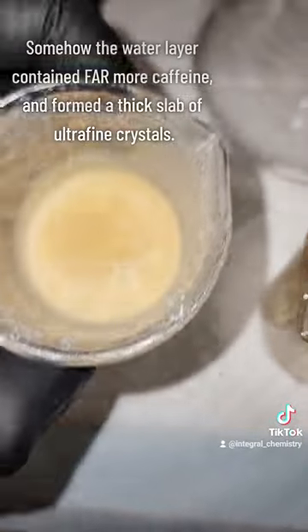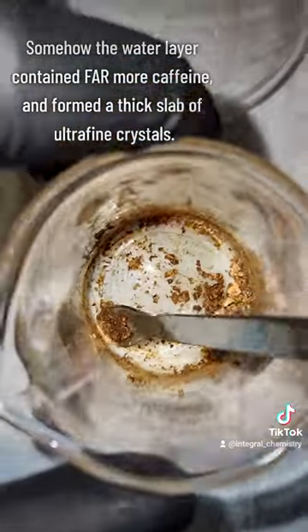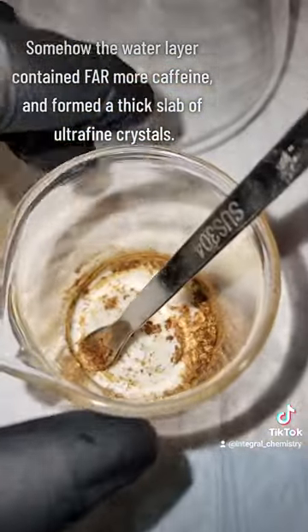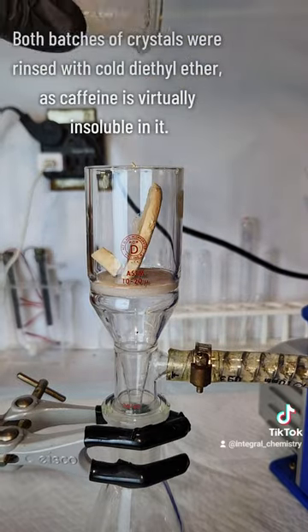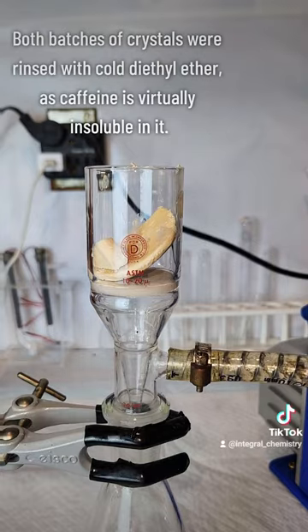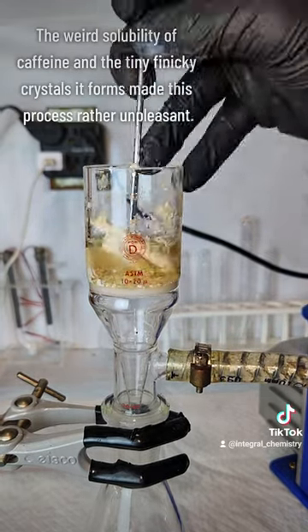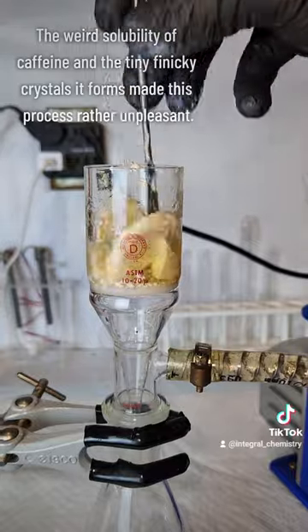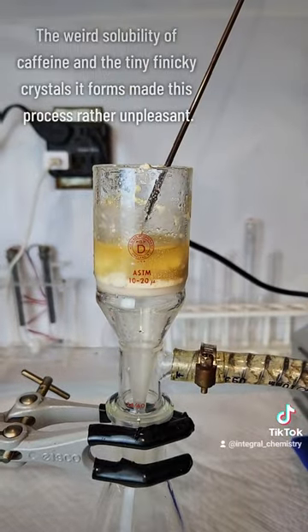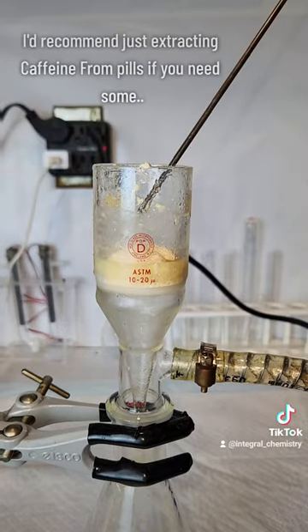This was then placed in the freezer to crystallize, and this time I got a really thick slab of caffeine, which I'm kind of surprised by. The chloroform layer gave me a much smaller, dirtier product, but regardless, I transferred both to a vacuum filter to try to clean them up as much as I can. I rinse both thoroughly in freezing cold diethyl ether, and this is done because caffeine is basically insoluble in diethyl ether, while any contaminant should dissolve just fine and be pulled away by the vacuum.